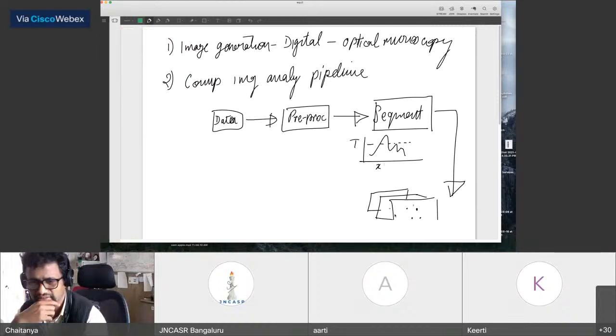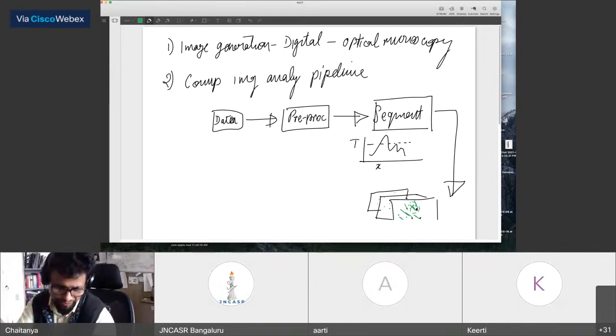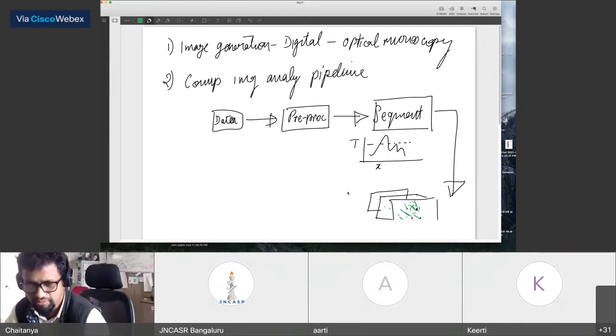And for that reason, tracking is of vital importance. And we discussed a so-called search radius approach, which helps you link the points to their coordinate partners in time. And someone, I think, asked the question, will size decide it? Well, in a way, size decides it because there is a combination of the two problems.